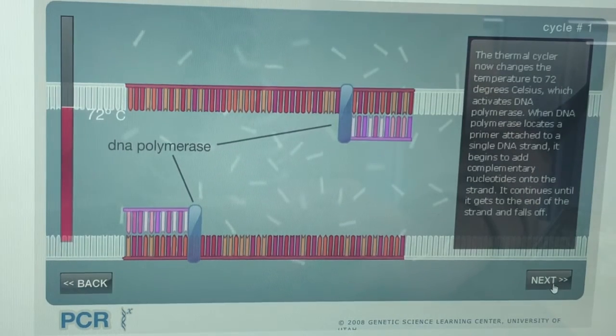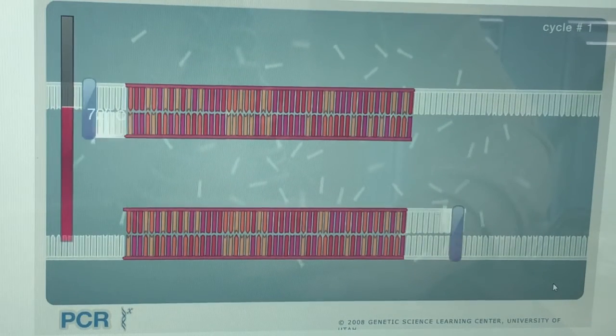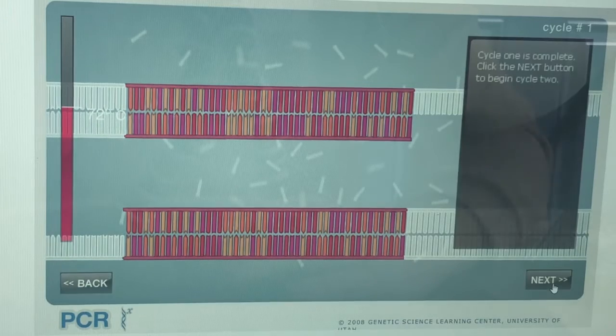The thermal cycler now changes the temperature to 72 degrees Celsius, which activates DNA polymerase. When DNA polymerase locates the primer attached to the single DNA strand, it begins to add complementary nucleotides onto the strand. It continues until it gets to the end of the strand and falls off. Cycle 1 is complete.